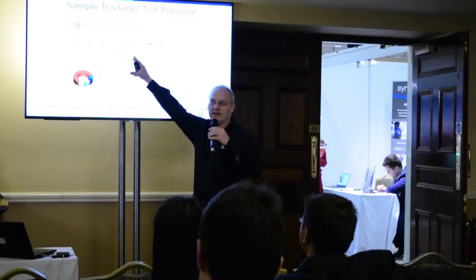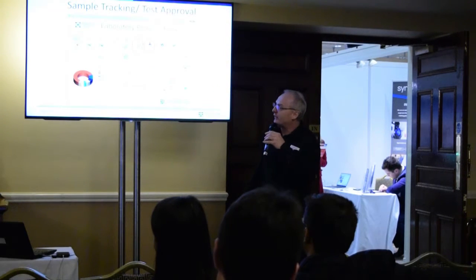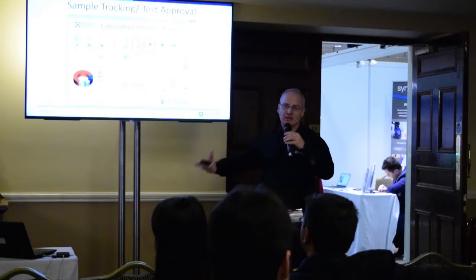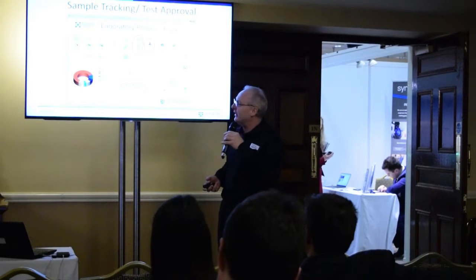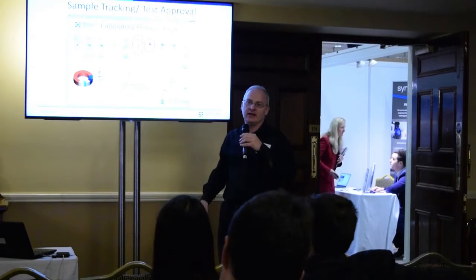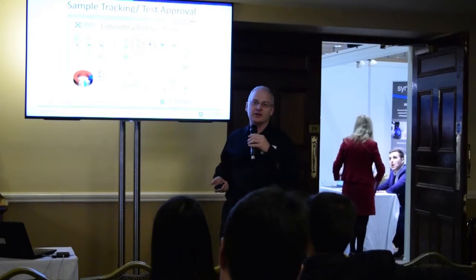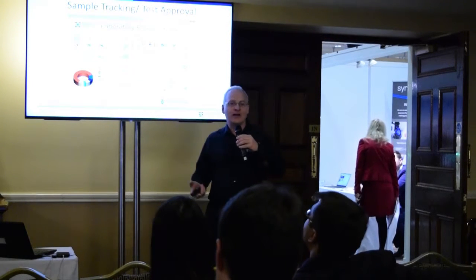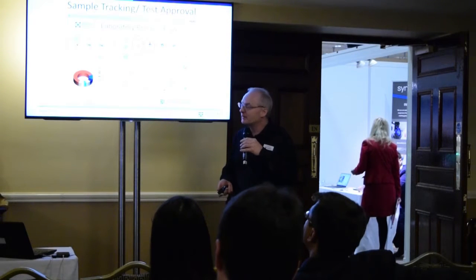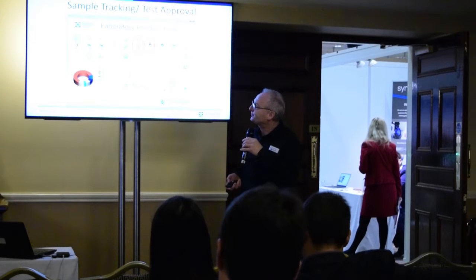The local data, test level, and then there may be an overall level for approval for the lab. And that might be the laboratory manager goes in once a day and approves all the testing being done. Again, that can be password controlled, so that only certain people can approve it. All that information is kept in the database, so that you know who validated it, who approved each test, and keeps a tight control of the whole lot.